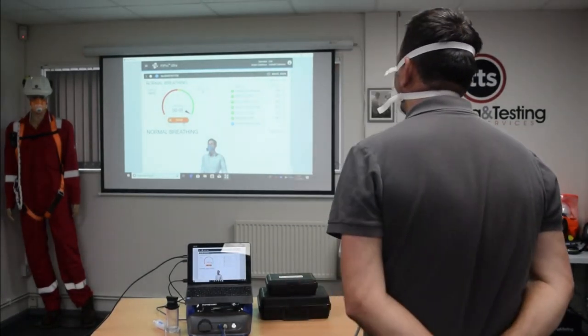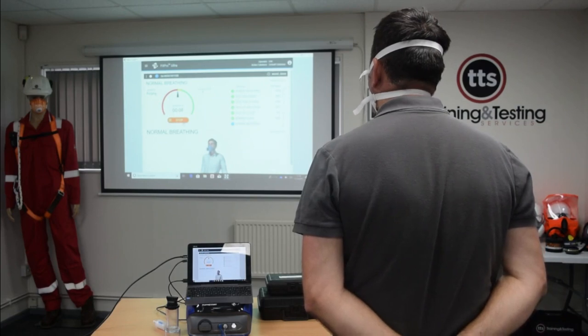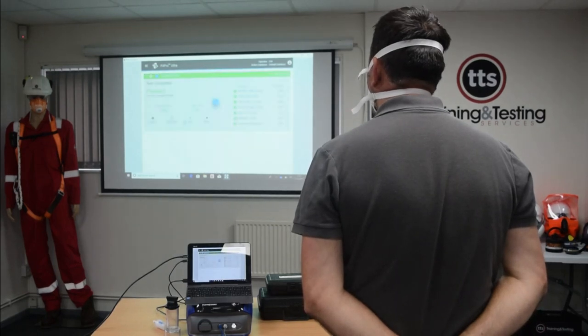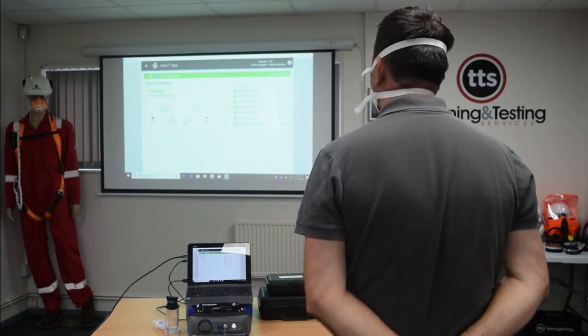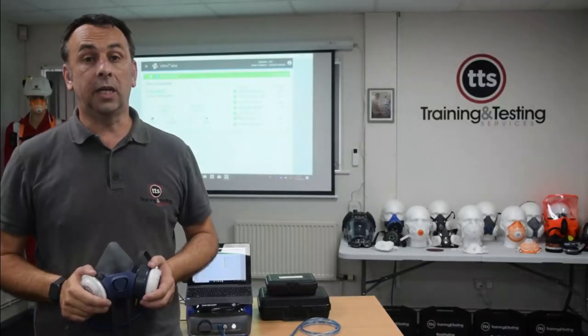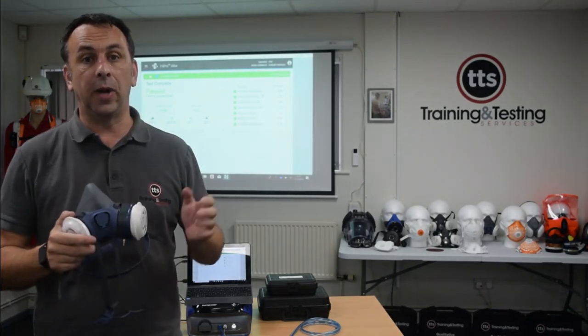Okay, I'll just wait for the machine now to finish its final calculations, and that should end the test. And that's the test completed. That's a good pass with an overall fit factor of just over 2,500. Okay, so that's the test complete with the Alpha Solway 3030V. What I'm going to do now is set up the machine and get straight on and test the Moldex 7000.